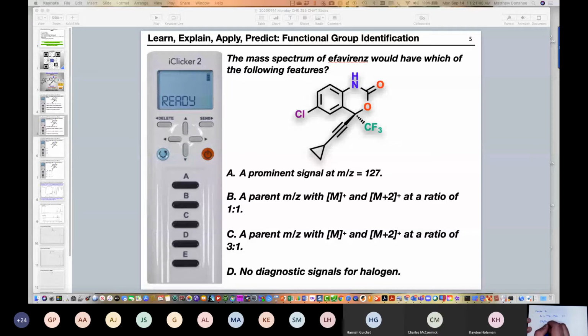So this is what I mean by this molecule would be the M plus, and this would be M plus 2. So see the difference, 81 minus 79, that's where you get that plus 2. So if we had, let me just get out my calculator. I'm pretty bad at doing math fast. So 79 plus 12 plus 3, that's 94, right? So we're just adding these two here. So this M to Z is equal to 96.